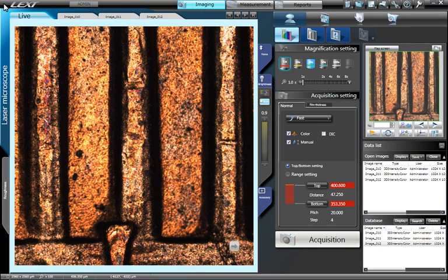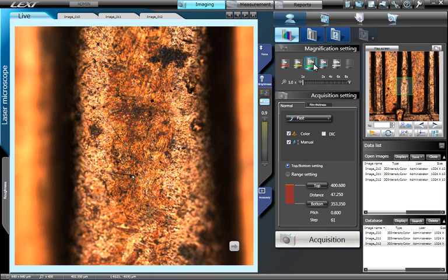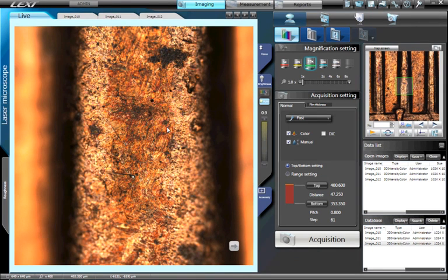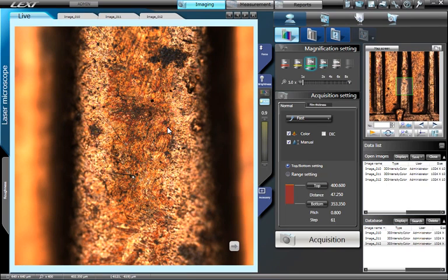Next, increase the magnification. Now that you are at a higher magnification, focus in on the top of the sample and adjust the brightness.